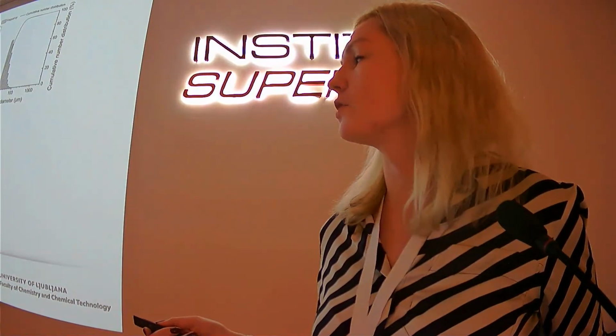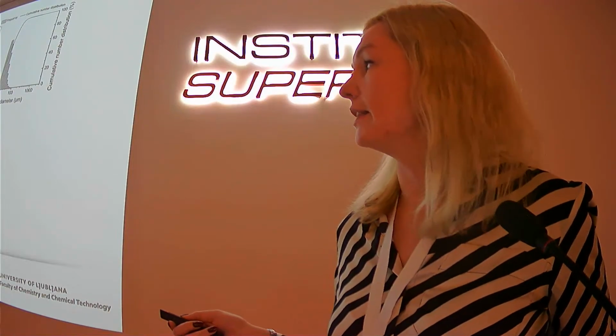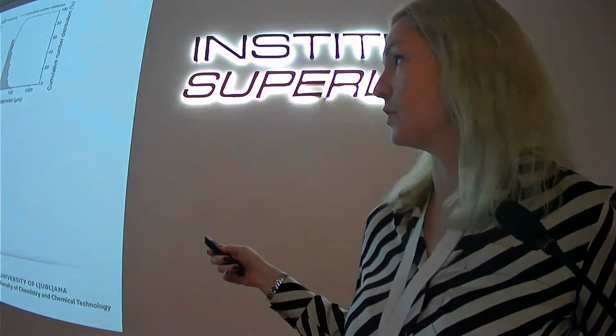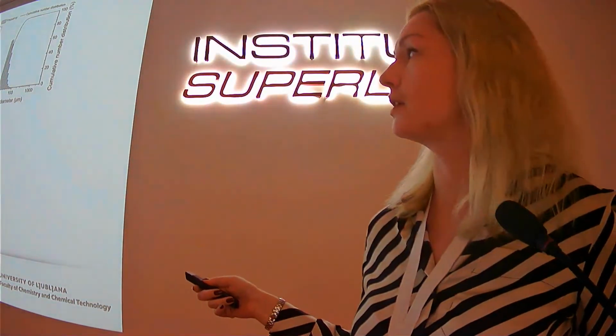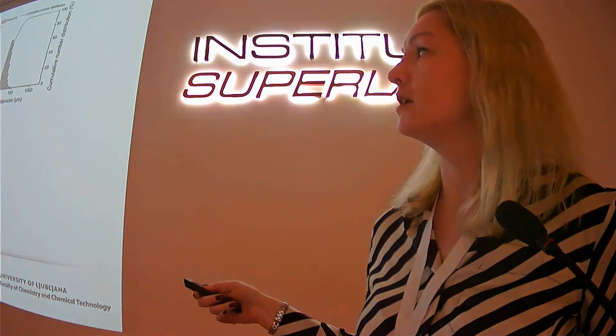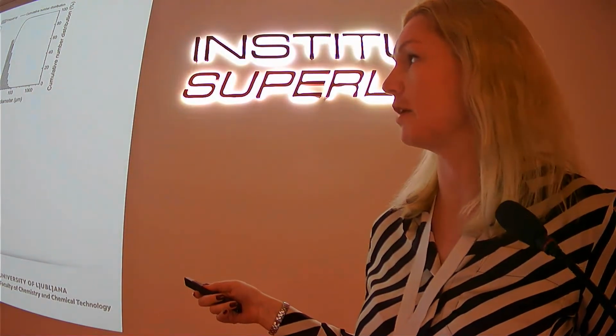There were many very small particles that were also attaching to the larger particles, but also they were here separately. And this is actually what I was talking about before, because there were so many more of these smaller particles in comparison with the larger particles. The size distribution by number shifted towards the smaller particles, but here is, for example, the mean size of the size distribution by volume, and you can see that the volume distribution shifted towards the larger particles.